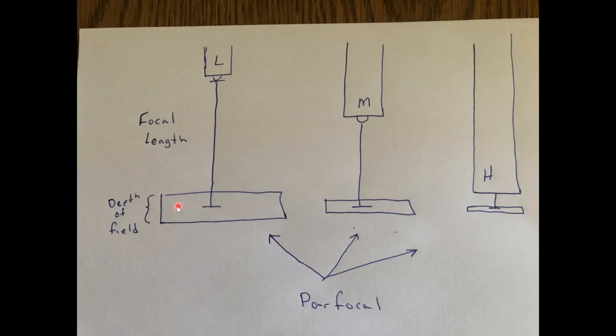And that's hugely important because each lens has a different depth of field. The depth of field is the slice of the universe that's in focus using that lens. The low power lens is very forgiving. So what would happen is you would put your specimen on a stage, and then you would rotate the coarse focus knob, and your specimen would rise, it would come up, and as it started to get toward the depth of field, you'd start to see something there, and then you'd be able to see it a little better.